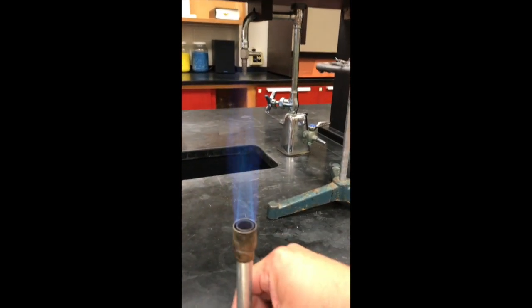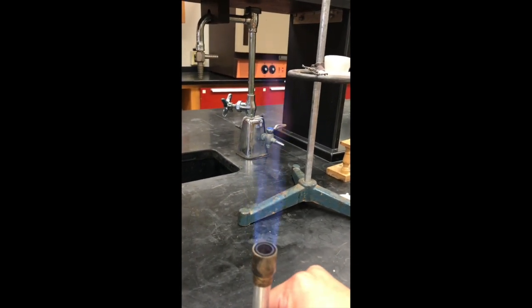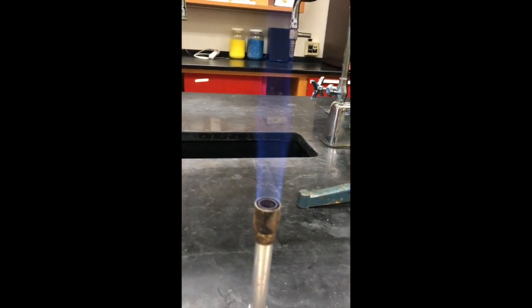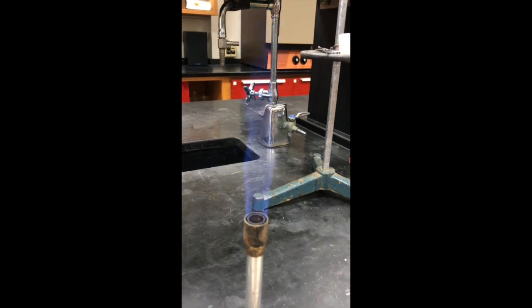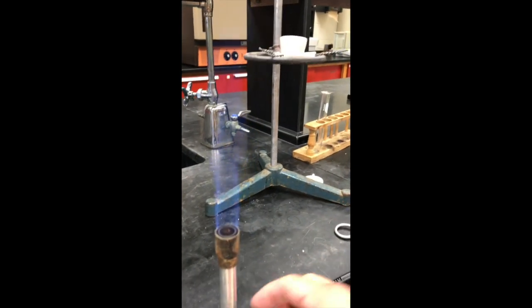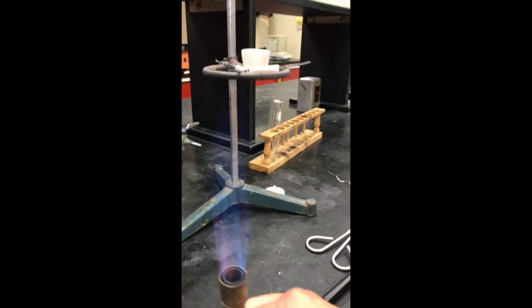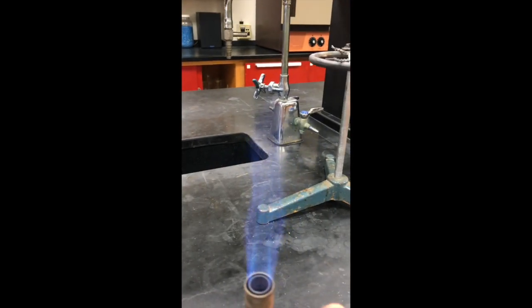Now if I turn this clockwise, that inner cone is going to kind of disappear, and we'll have a flame that just isn't moving that fast. It's just not making that much noise. So this is a cooler blue flame. There are going to be times when we need a really hot blue flame. Hot flames refer to the inner cone. Turn it counterclockwise until you see that inner cone. If you need a cool flame, you turn it clockwise until the inner cone goes away. Right now that's a cool flame.